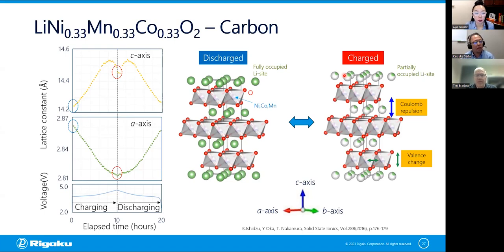Right. It depends on how much data you collect for potentiostat and the X-ray diffraction. If you collect, for example, thousands of diffraction profiles and thousands of potentiostat data, there might be some software limitation, but to be honest with you, I apologize, I don't know the exact answer for now.